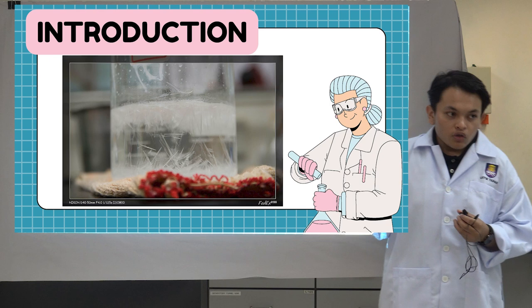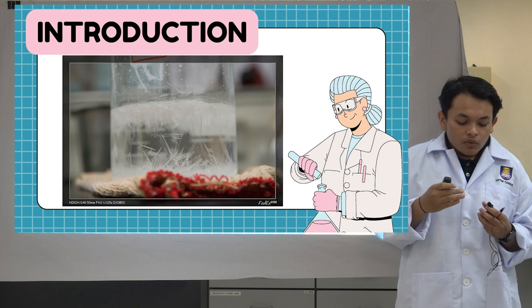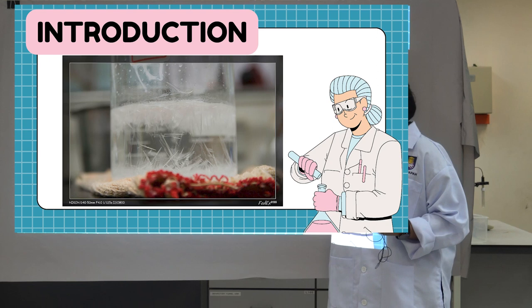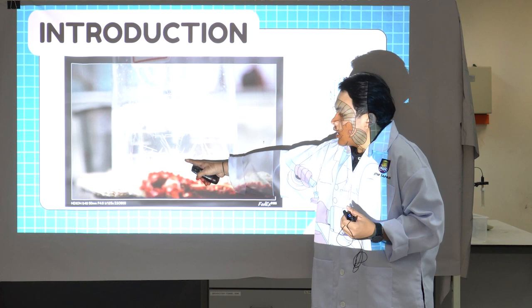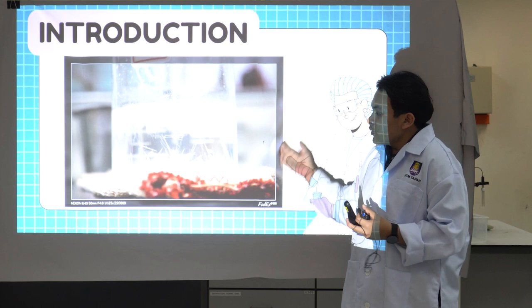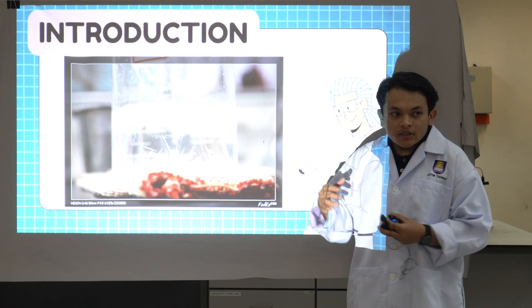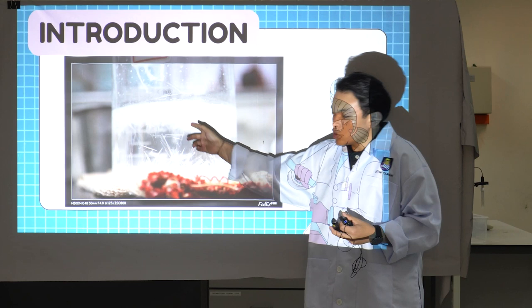So the basic concept is we dissolve it in the proper solvent at high temperature, which means we must heat it up, and then it will solidify at low temperature, which means we cool it down, and it will create crystals naturally. This crystal is a pure compound, more pure than before. But it isn't 100% pure, so we must repeat it a lot of times to increase the purity. In this solvent, we have distilled water, right? But it also leaves the impurities in the solvent.